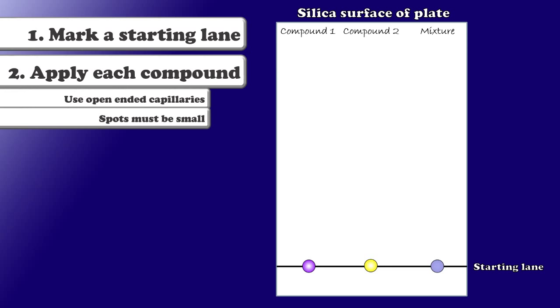So now I have very thin layers or very small spots of my compound on the thin layer of silica. These spots have to be very small. The smaller they are, the better they are. You can make them more concentrated by tapping the capillary to them several times and allowing the spot to dry in between those. It's important that they be at least one full spot diameter apart from one another and away from the edge of the plate. This is because as the chromatography experiment progresses, these spots naturally tend to expand a little bit because of diffusion.